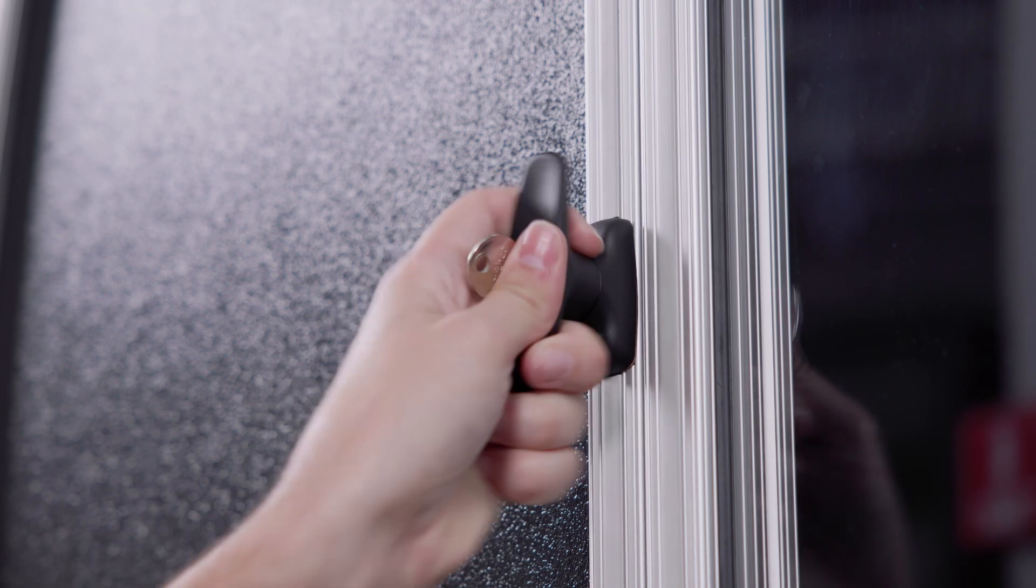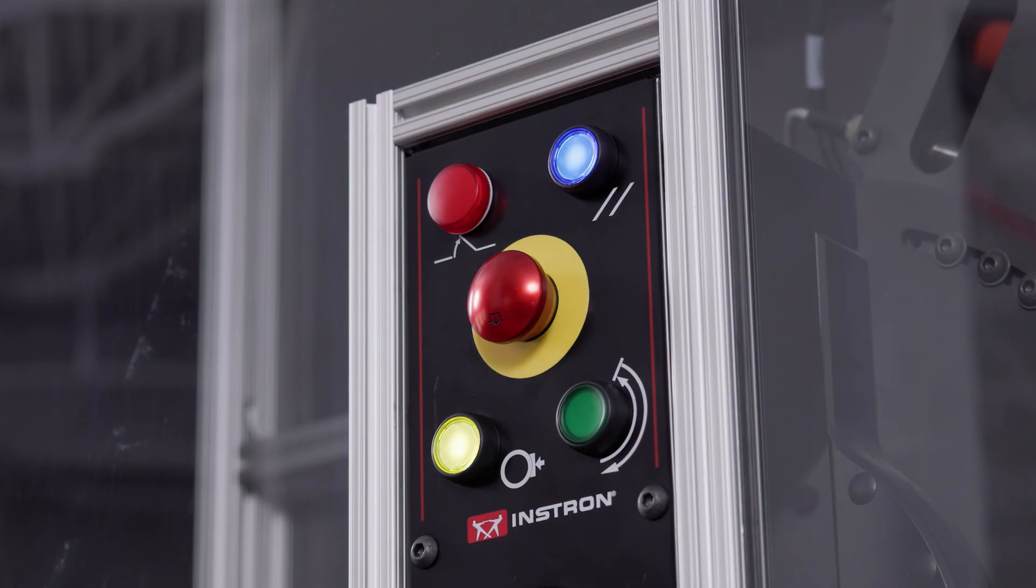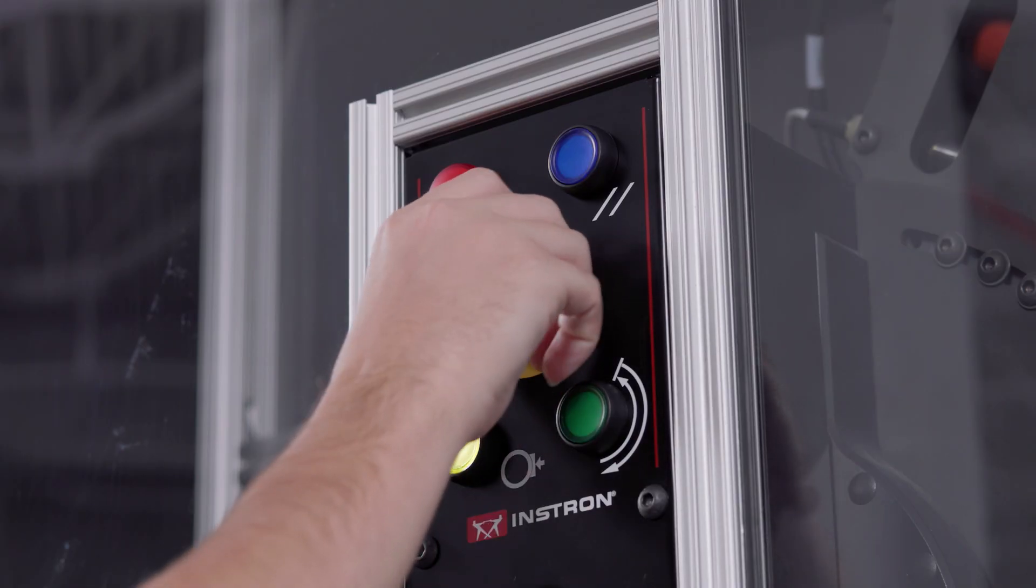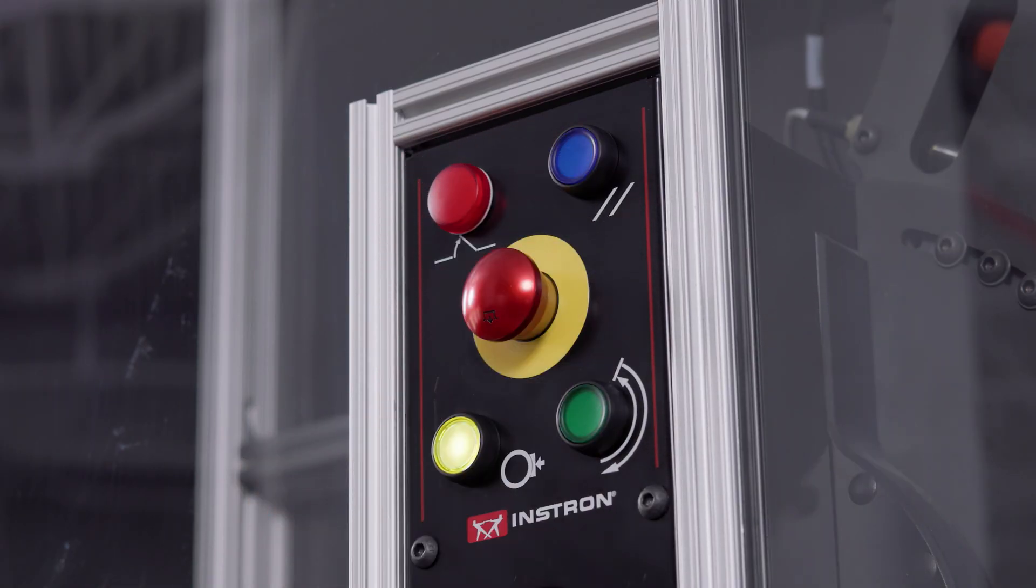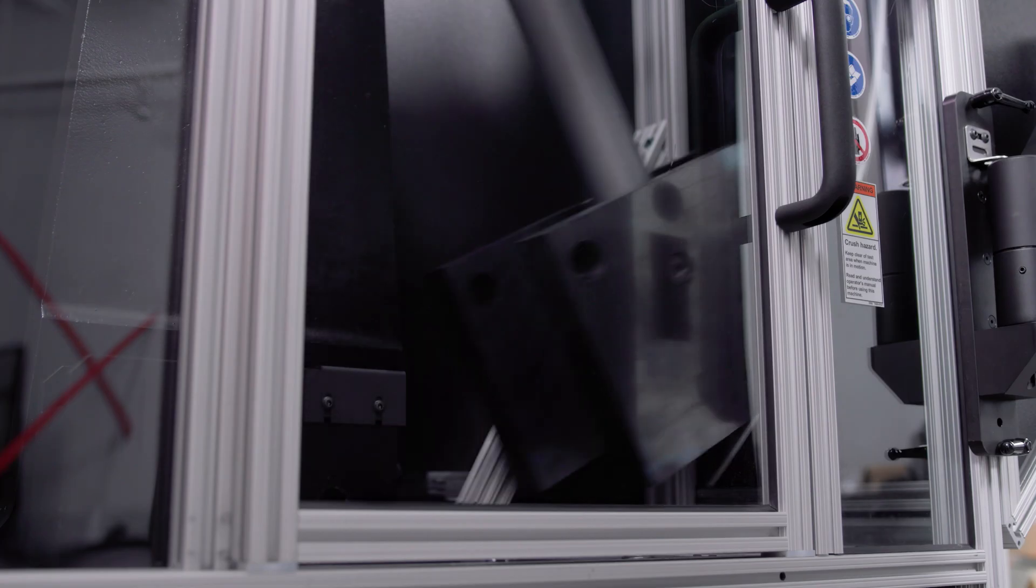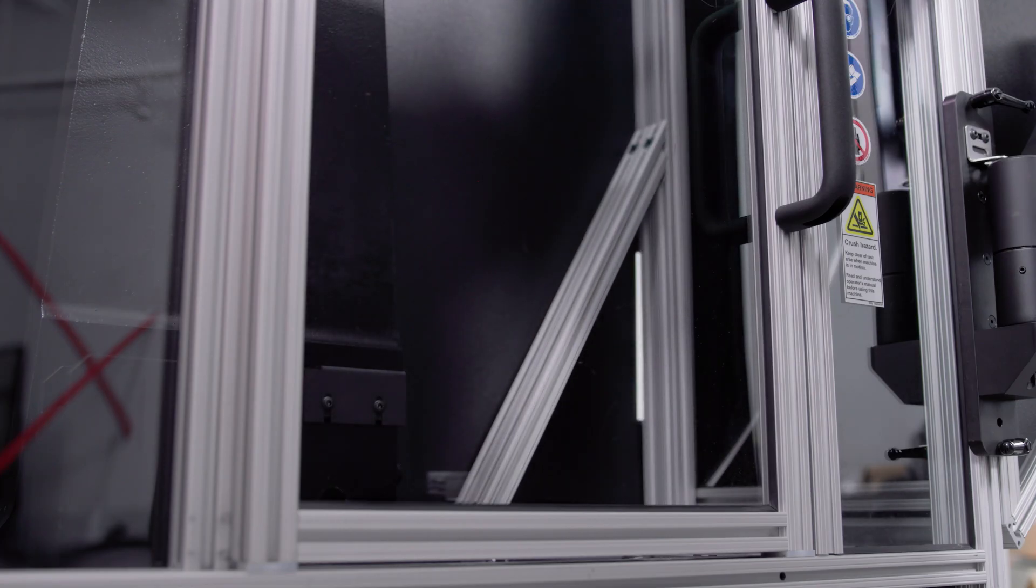To resume testing, you simply close and secure all access points, disengage the e-stop, and press the blue enable button, which acts as a secondary safeguard. The last step is to press the green button, which brings the hammer back up to the latched position.